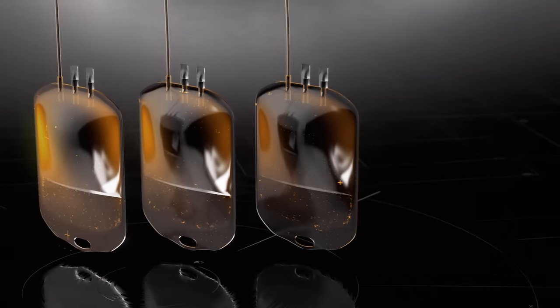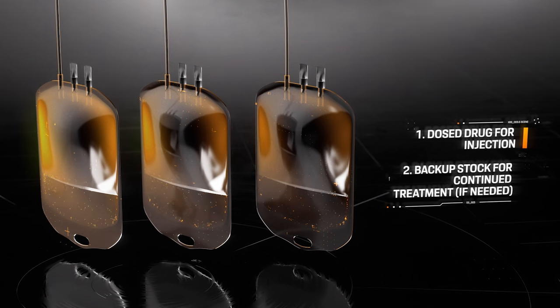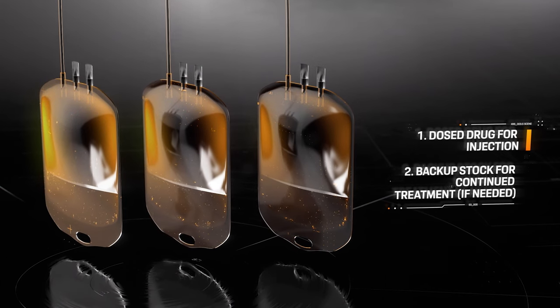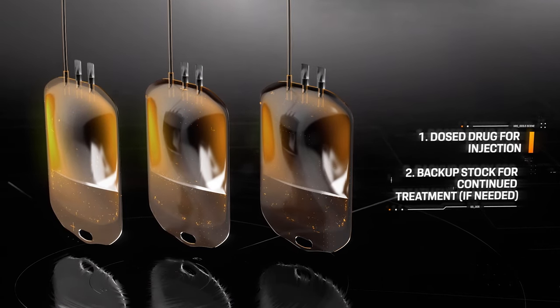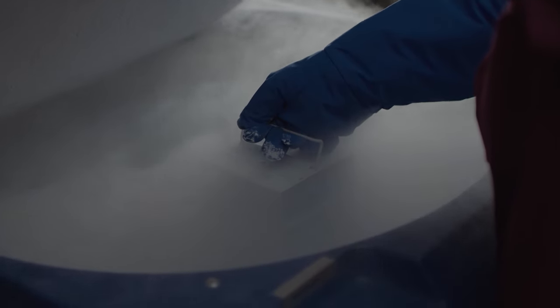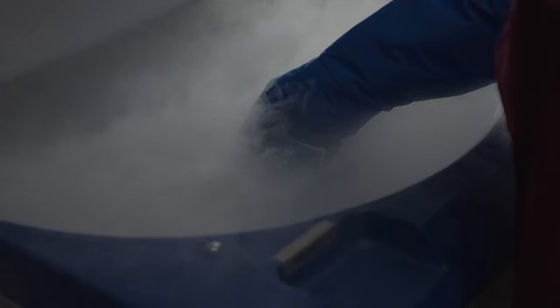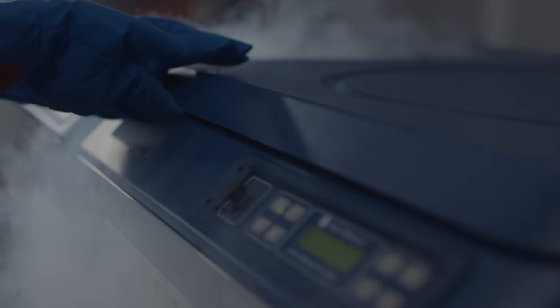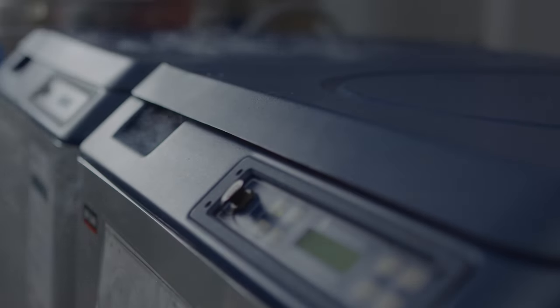Two to three weeks later, according to the QC results, an automatic harvesting procedure is initiated and the CAR T is collected in a specified amount and divided into doses to be sequentially administered to the patient. A predefined part from the overall yield will be separated and stored in liquid nitrogen cryobank. These cells can be used later according to treatment requirements.